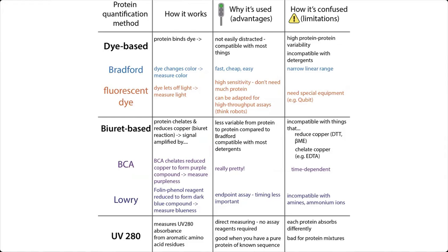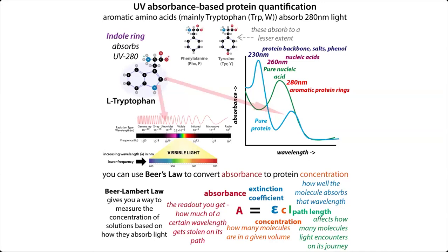So let's step back and think about what we actually mean by light. When you think about light, you might think about that stuff that comes out of your light bulb. But that's actually just one tiny portion of the electromagnetic spectrum. Visible light is the same type of thing as infrared, microwave, and radio. And if you go in increasing energy, ultraviolet, X-ray, gamma rays, all of these are just different versions of light.